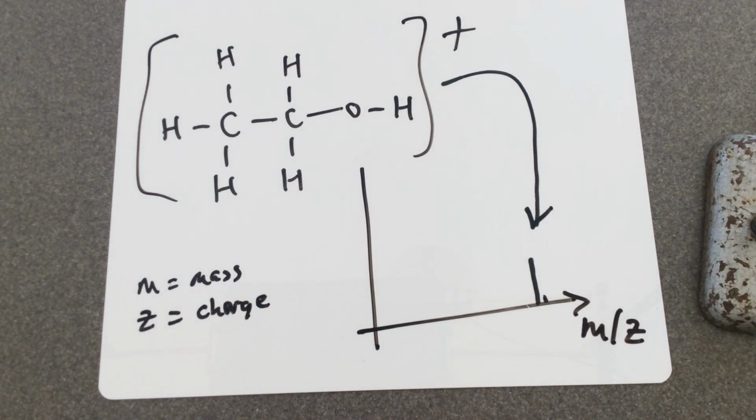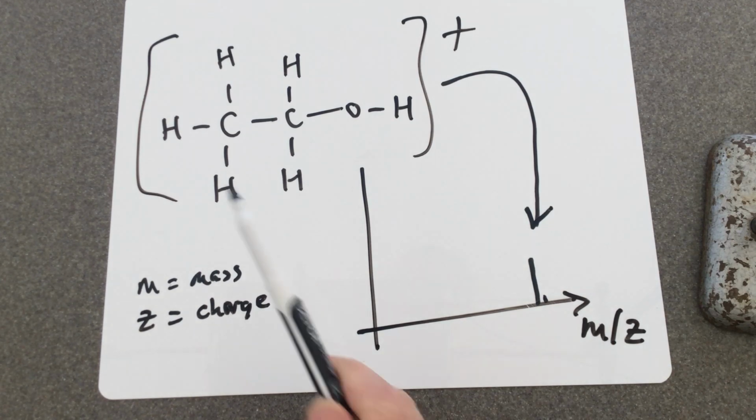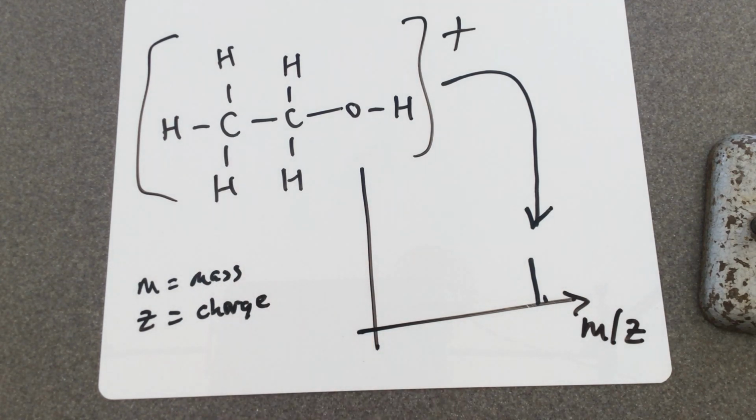It will be a carbon-13 atom, which will mean that in a very, very small percentage of molecules, hence the very, very small peak, there will be a molecular ion caused by the molecule with a carbon-13 atom in it. This axis, the y-axis, is the relative abundance axis. It is telling us the relative proportions of the different types of ions.